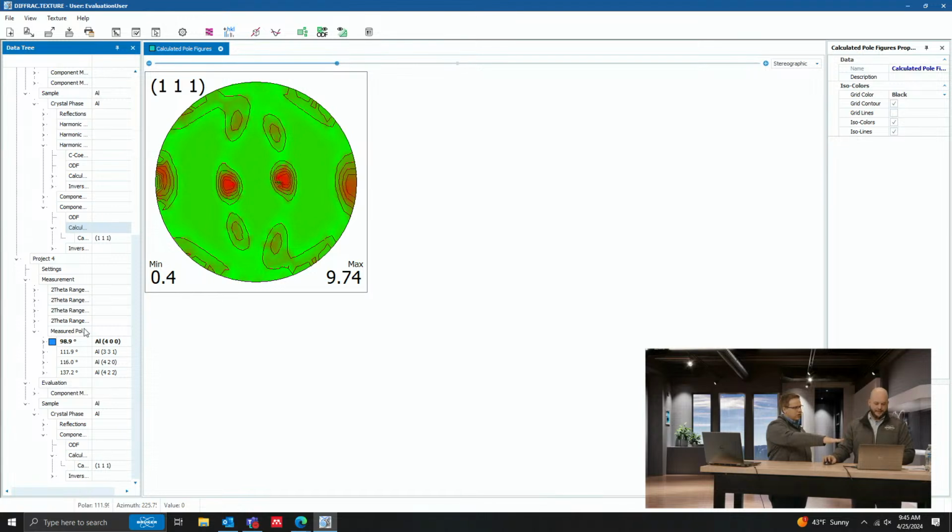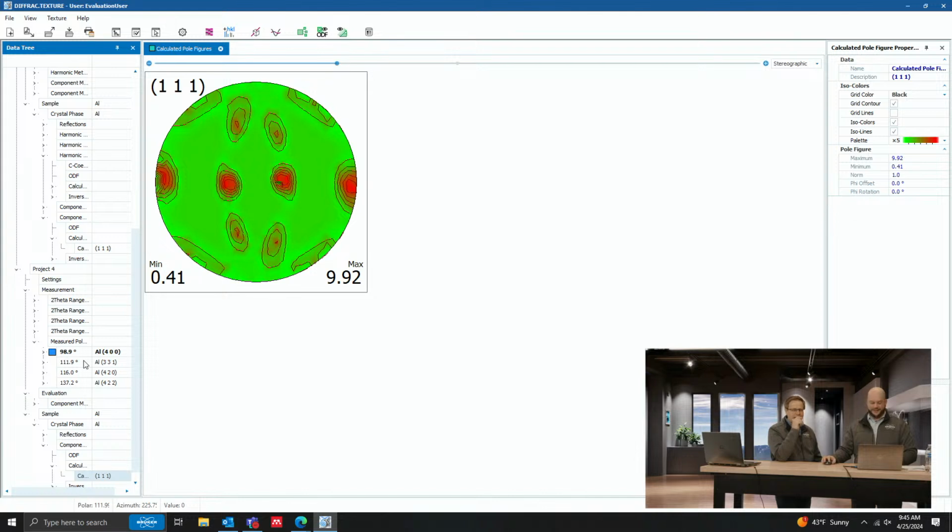And yeah, you can see that D6 does a really good job. Now if we compare that, so there's the D6 one. Now let's see, what did it look like on the same one, the component one? Same pole figure? Yeah, this is actually the D8, because you couldn't tell the difference. Exactly. Okay, so that's the D8 one. And this is the D6. It barely moved. Yeah, it's probably because I had error when I rotated the pole figures. You were the problem. Yeah, exactly.